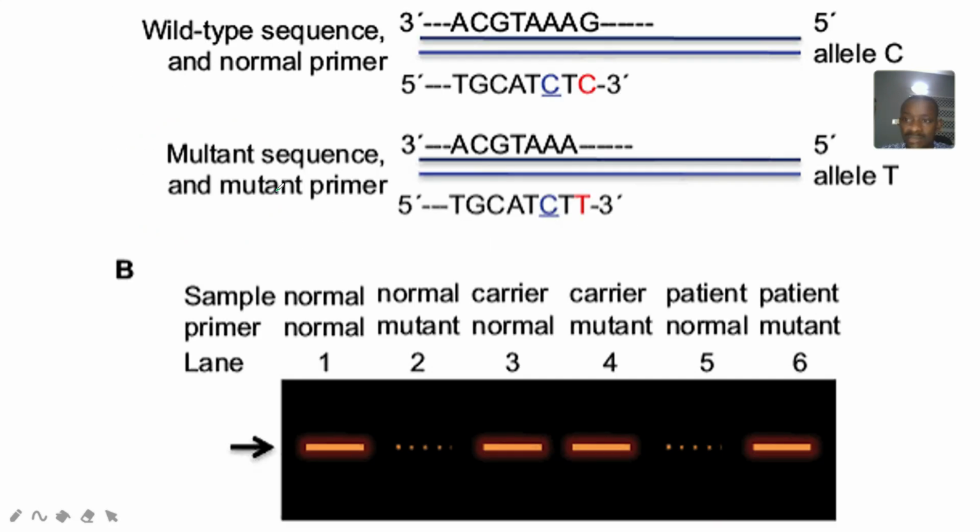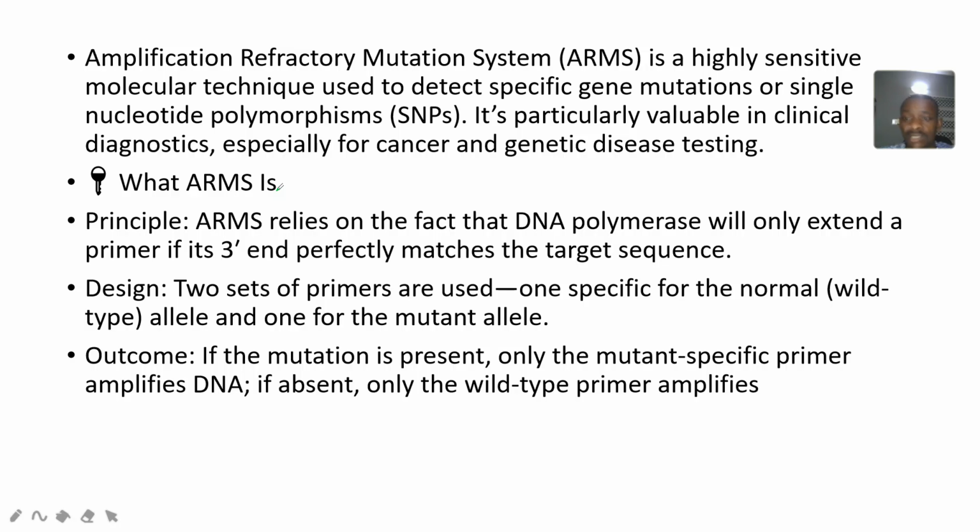Okay, so what is it and what are its applications? It's actually a highly sensitive molecular technique. It's used to detect specific gene mutations or single nucleotide polymorphisms. So it's particularly important if you want to diagnose cancer and those genetic mutations. Don't worry, we'll connect it.